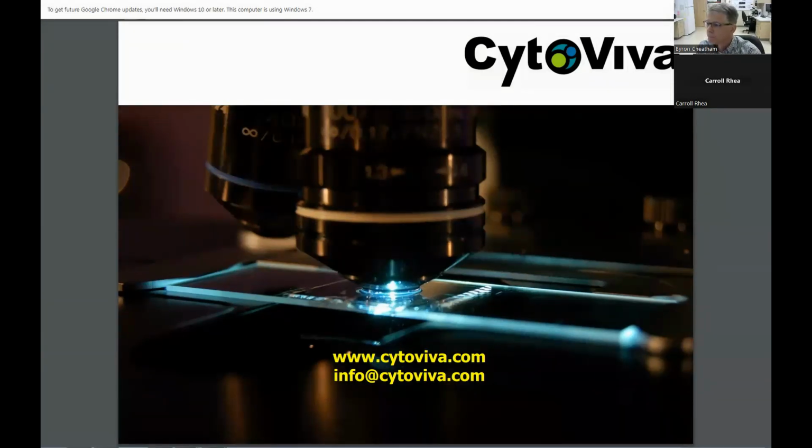Thank you. Our next one is from Andreas. Is the spectral profile normalized by the spectrum of the light source? Why do most signals have a close to zero value near 400 nanometers? Andreas, it's a great question. So typically when we normalize the data, it's typically normalized against the source illumination, right? And I call it lamp subtraction, but I get in trouble because the math is not subtraction, it's division. But yes, that's the process that's typically used.